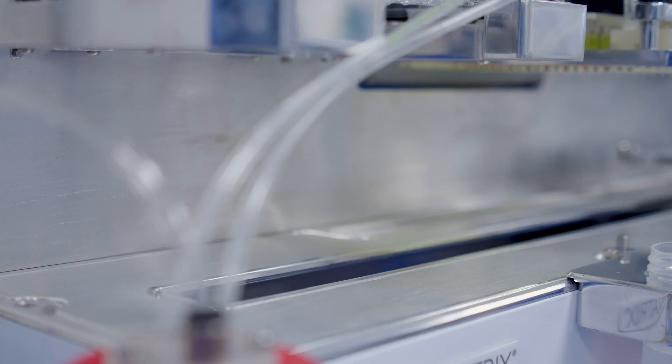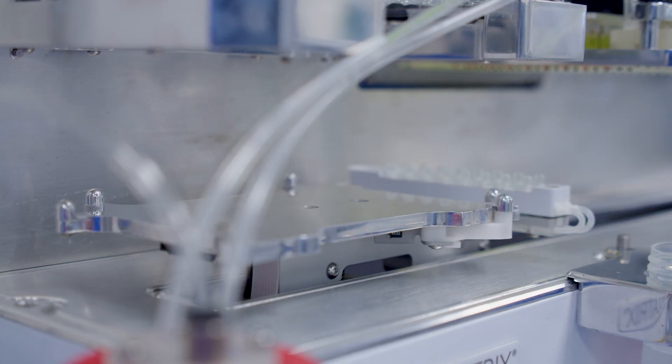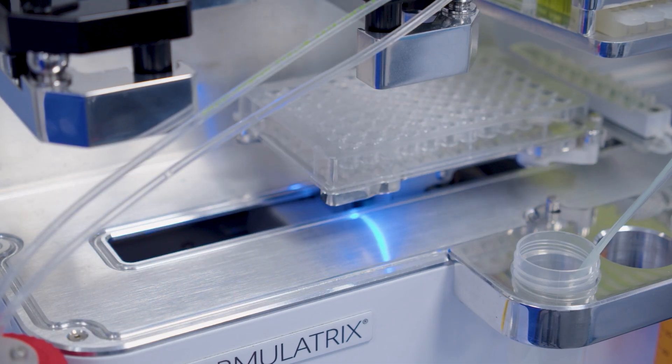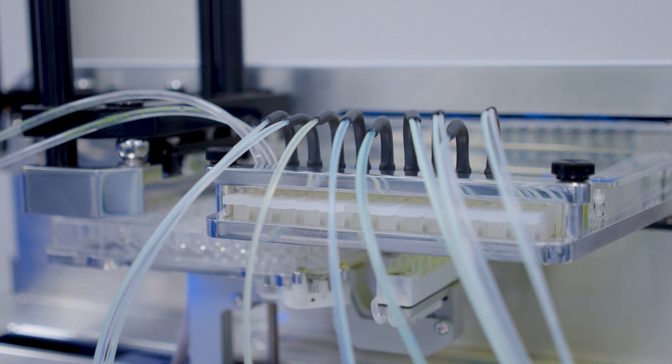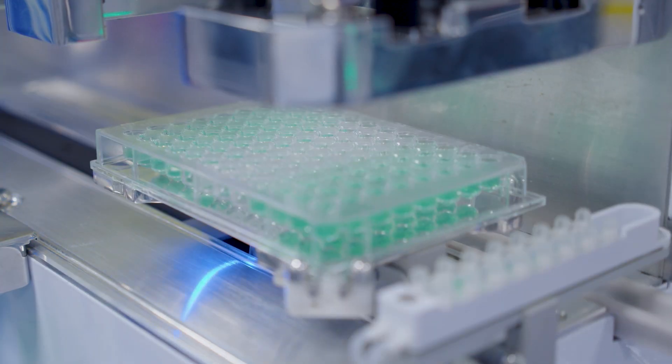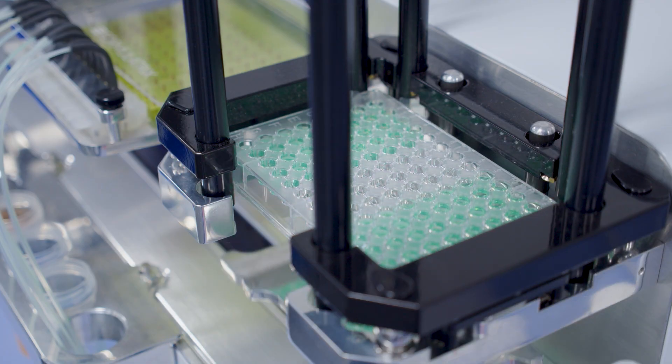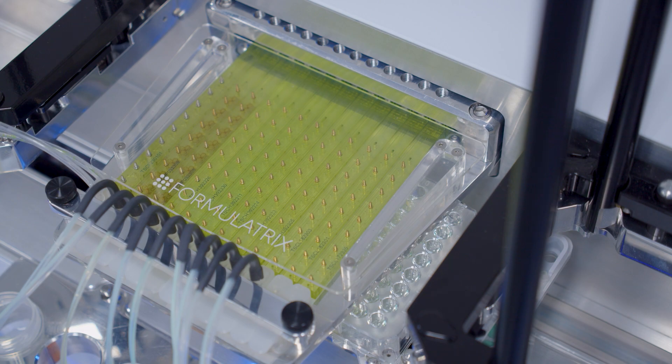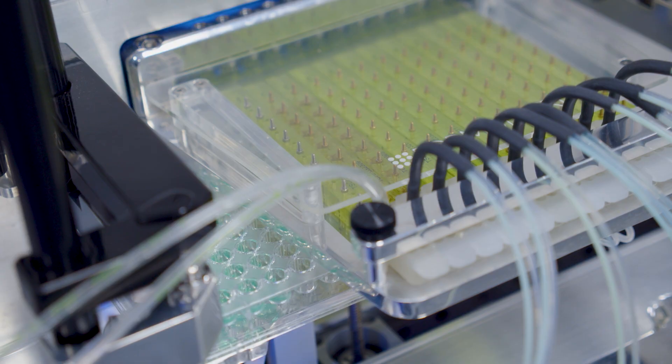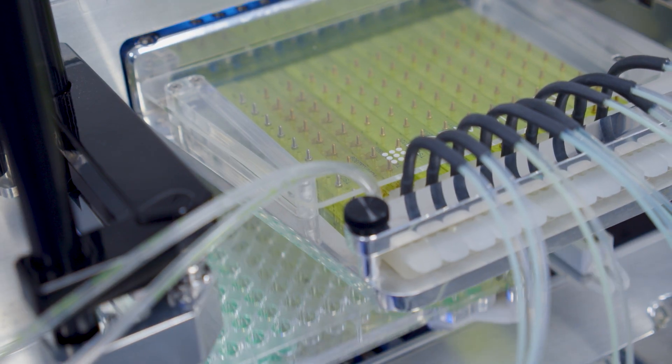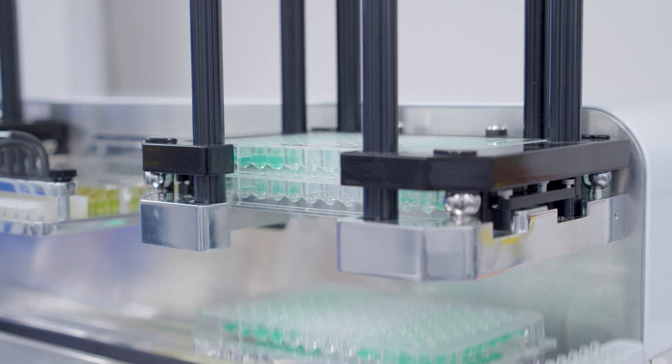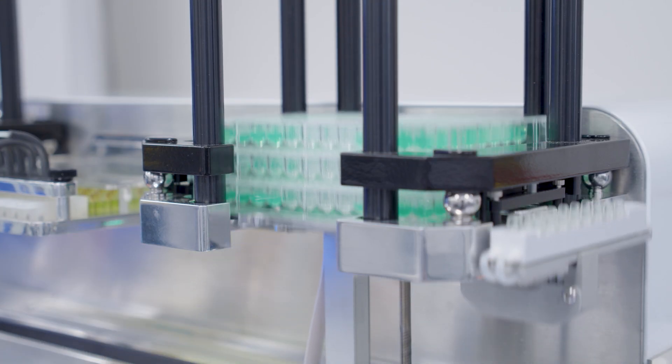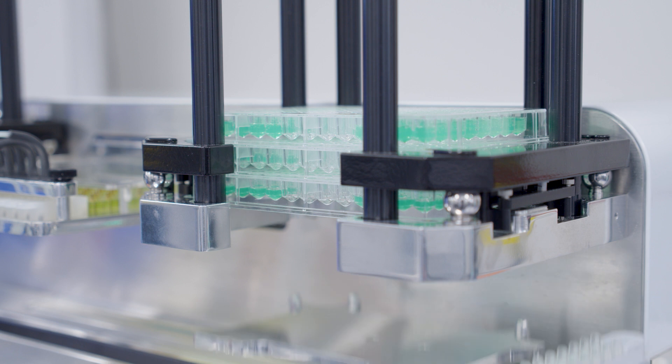Then press Play. The Tempest will kick into action and dispense onto the first plate. It will place that plate onto the second stacker and begin dispensing onto the next plate. Remember, the ordering of plates will now be flipped with the first plate being at the top.